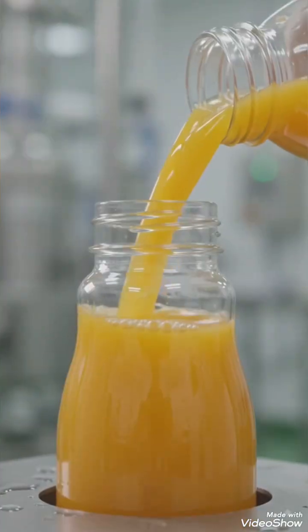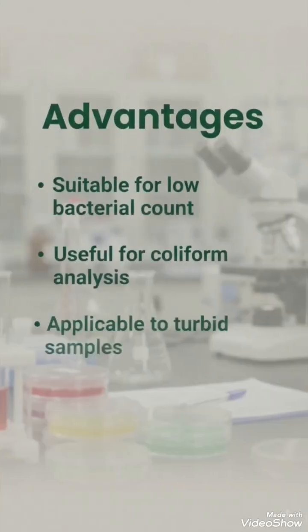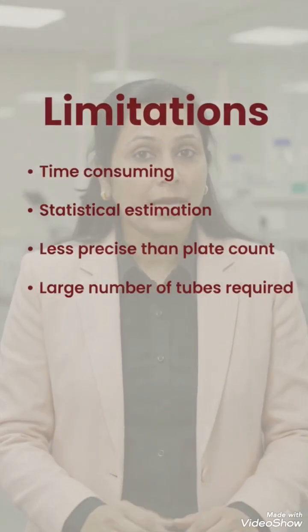MPN is especially useful when microorganisms are present in low numbers or cannot be counted reliably on agar plates. Let's discuss some advantages. It is suitable for low bacterial counts. Consider the limitations. It can be time-consuming and it requires many tubes.